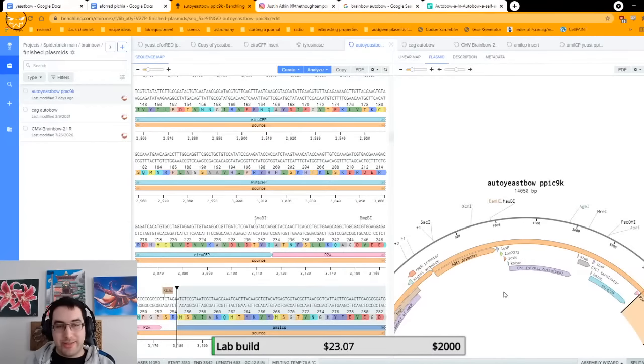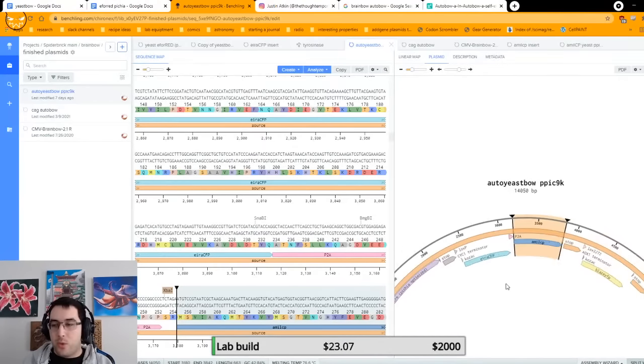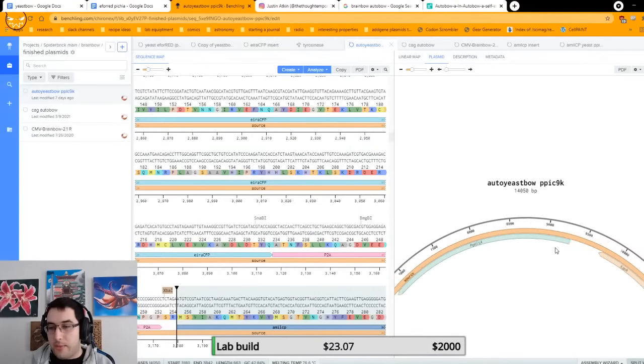So the trick to this is what you would do is you would take this piece of DNA once it's made, you put it into the yeast. You can then select the yeast that carry the gene using antibiotics. Or, I mean, you could use antibiotics. This also has histidine synthesis. So I could actually sell the kit with no antibiotics. It just means I need to get a lot of the media, which is not so bad if you're buying in bulk.